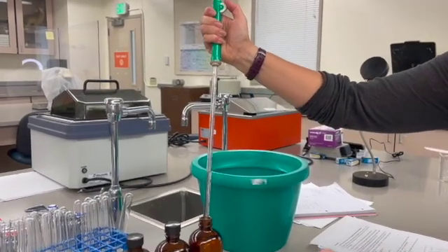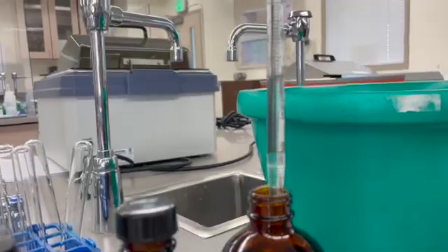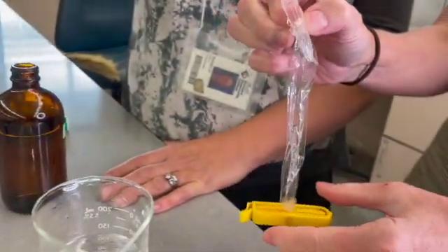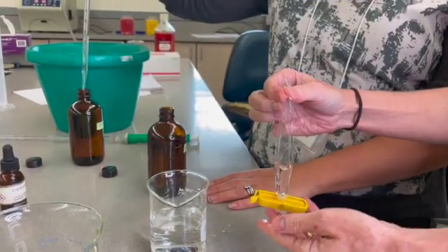First, we measure out some starch solution using a pipette. Starch solution is just starch molecules dissolved in water. We add the solution to a piece of dialysis tubing that has been clipped at the bottom.